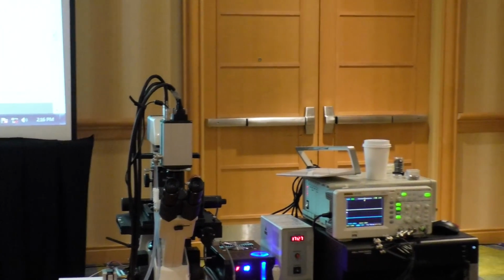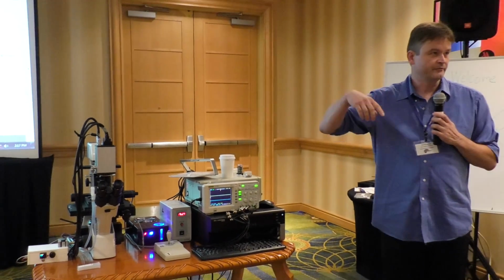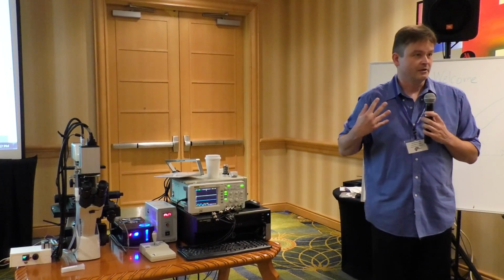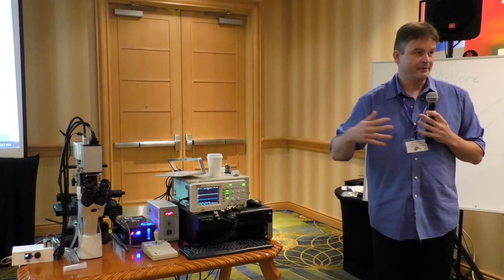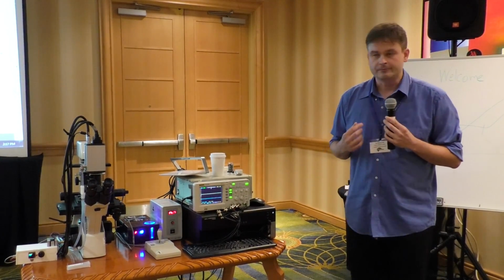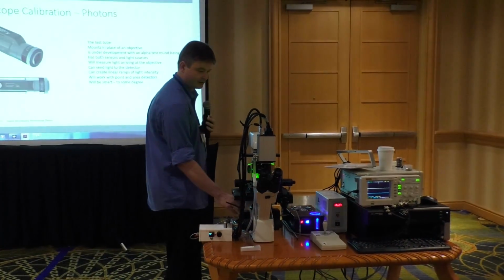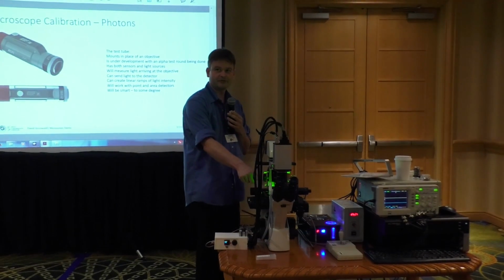And then what they do is they're sensors for photons in, photons out. They can measure photons and they can generate photons. They can do that over different wavelength bandwidths and over different power levels. And that is important because, just as a little question of curiosity, does anybody have an idea how much light this is?